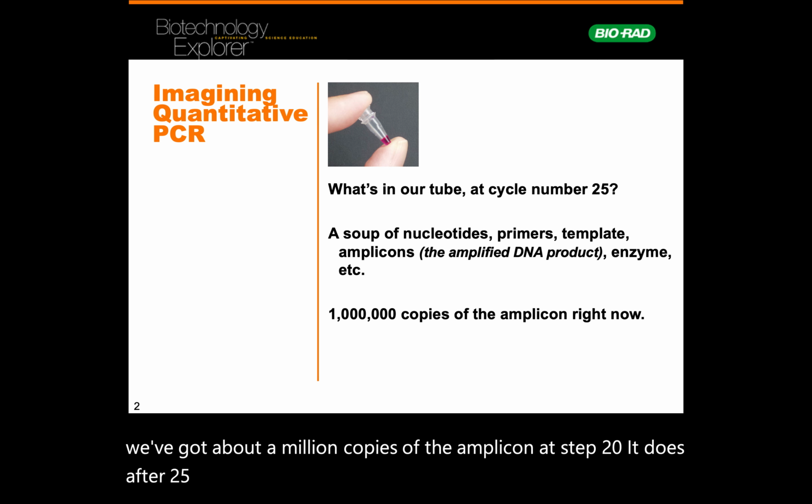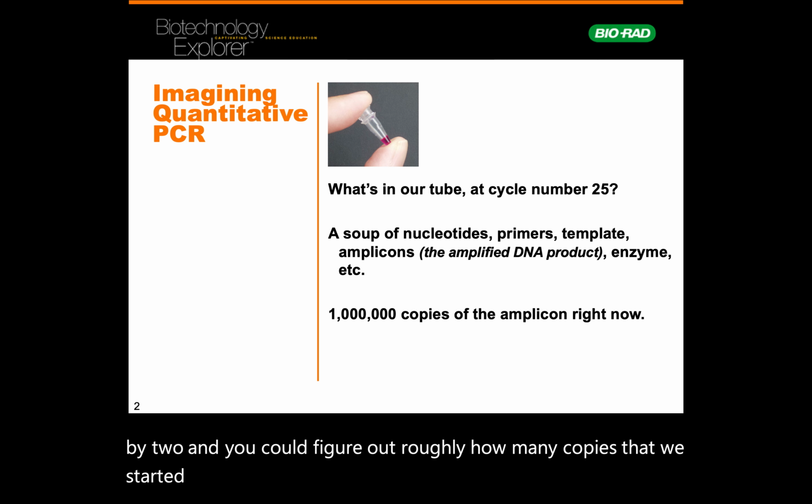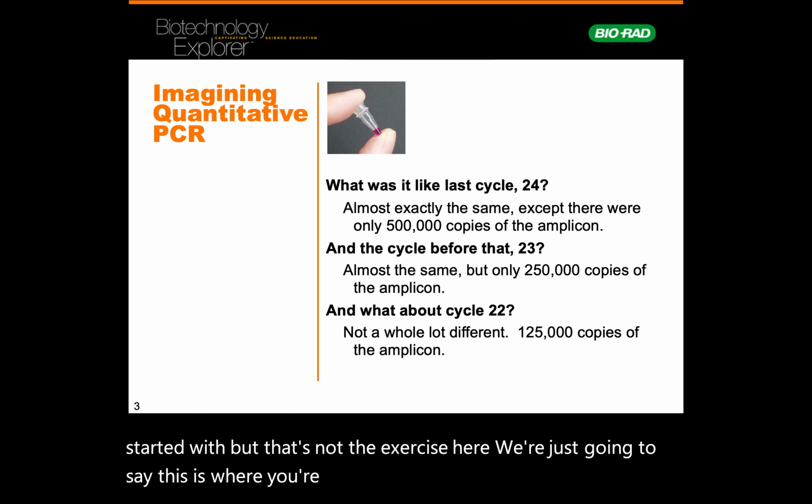You could work that back, just keep dividing by 2, and figure out roughly how many copies we started with. But that's not the exercise. Here, we're just going to say this is where you're starting. So let's just accept this.